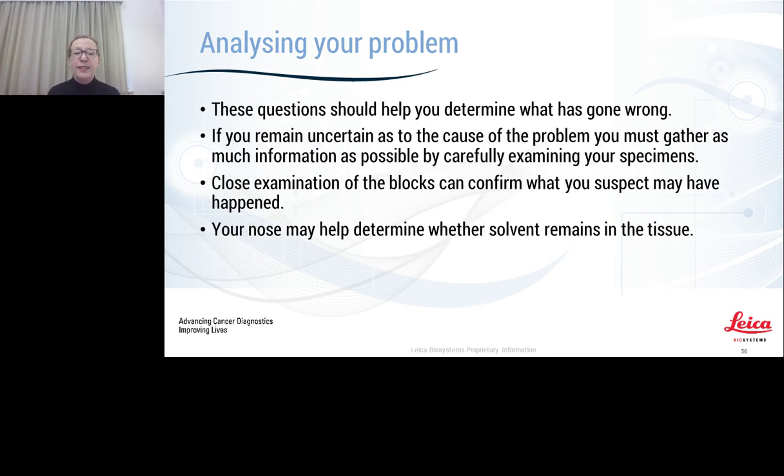So all of these questions, acting as a checklist, can really help you determine what has gone wrong. And if you remain uncertain as to the cause of the problems, just gather as much information as you can by examining your specimens, thinking about different possible causes, and thinking about the situation as well. Close examination of the blocks can confirm what you suspect may have happened, and your nose can help if there's still solvent left in the tissue.